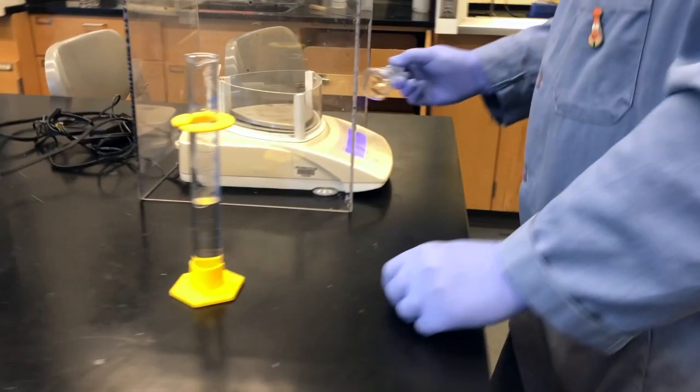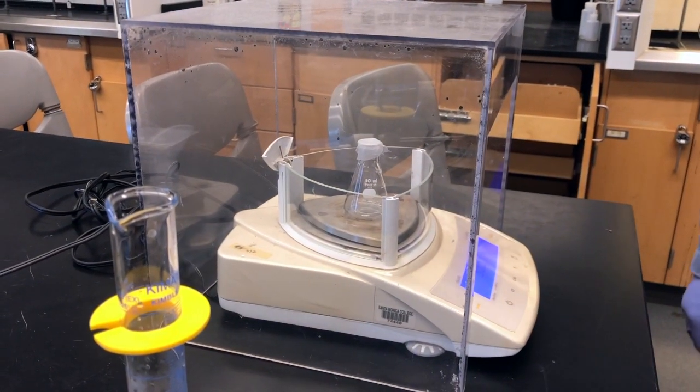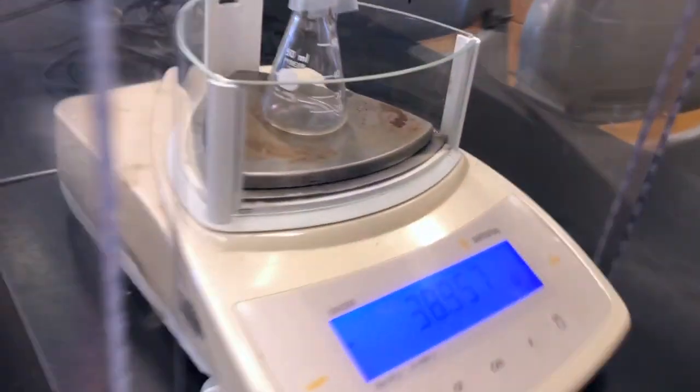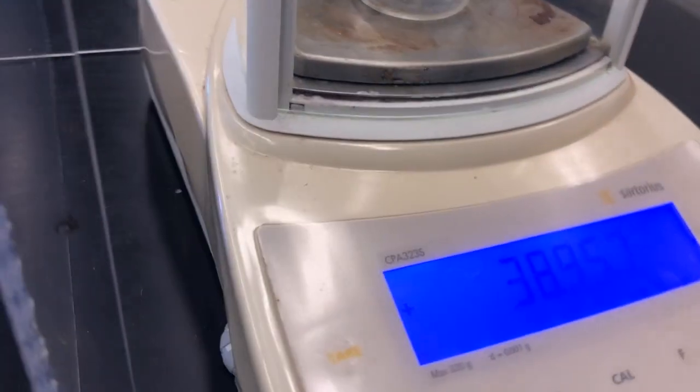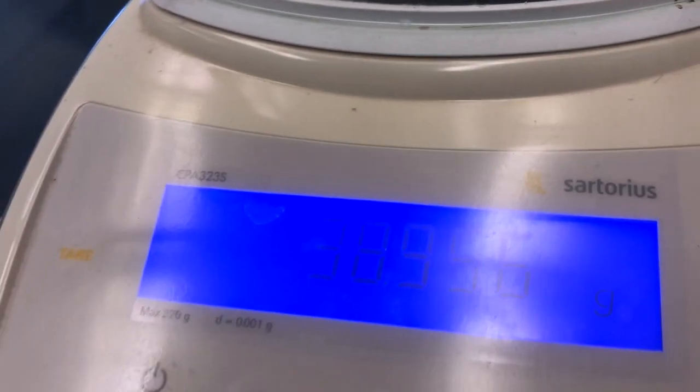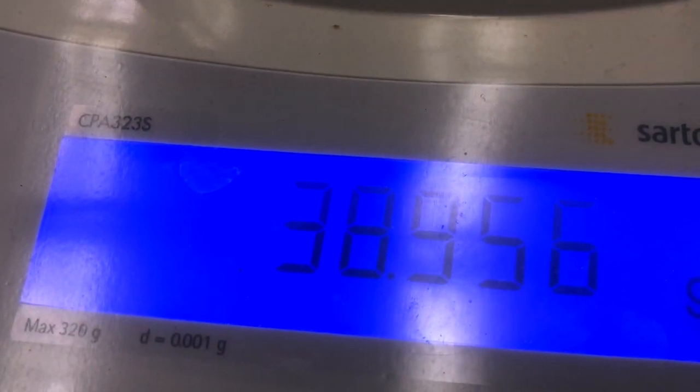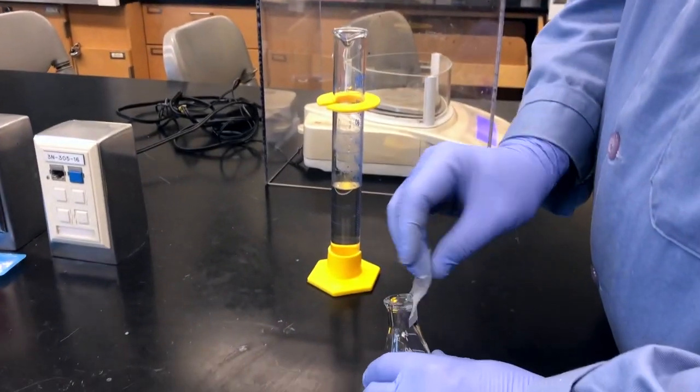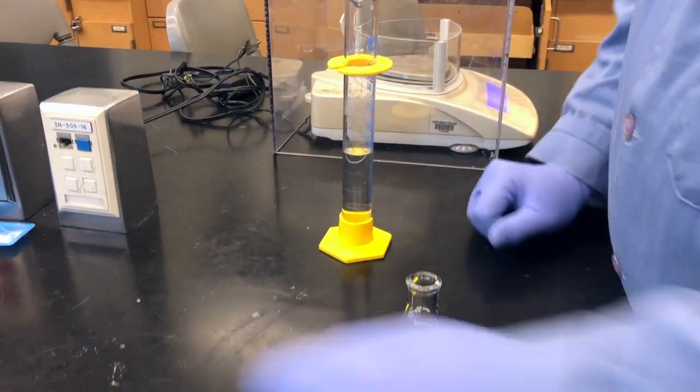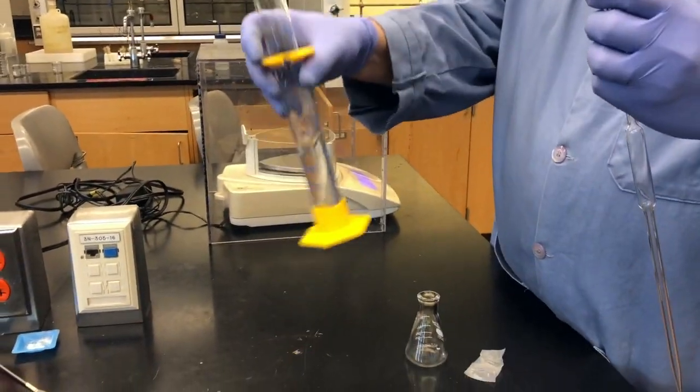Now it's time to measure the density of our distillate. We start by weighing a small Erlenmeyer flask with a piece of parafilm. Record the empty mass into your notebooks. The density measurement is important because it tells us the percentage of alcohol both by mass and by volume that's found in our distillate.